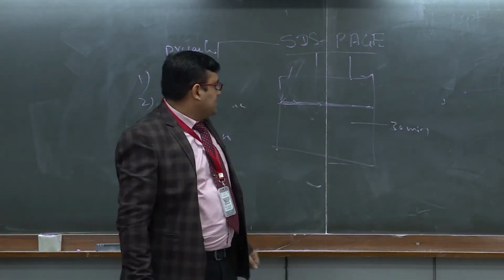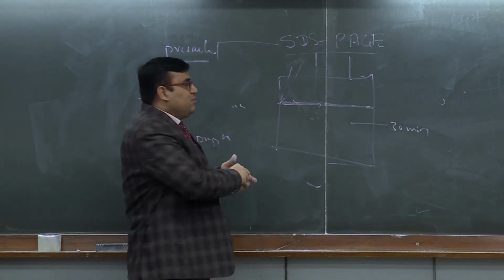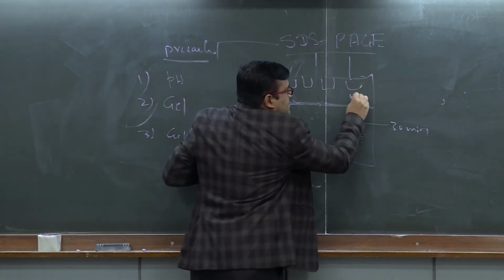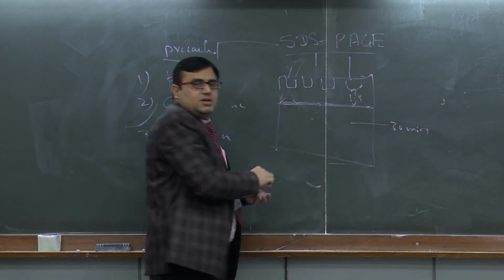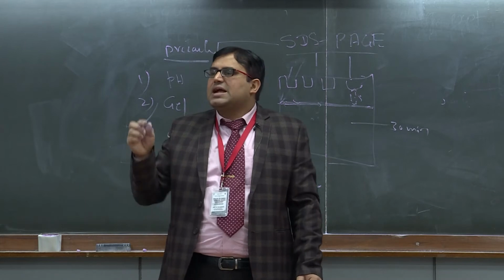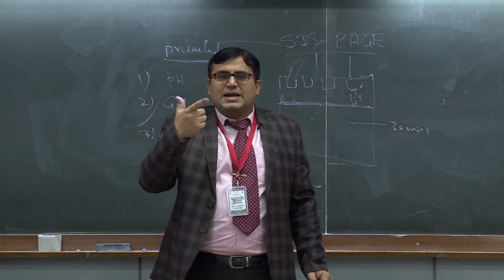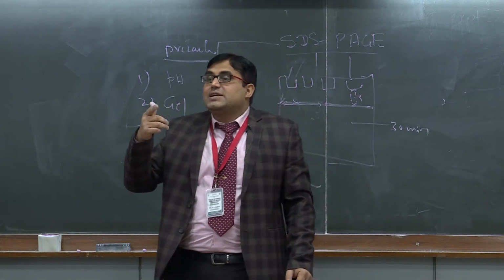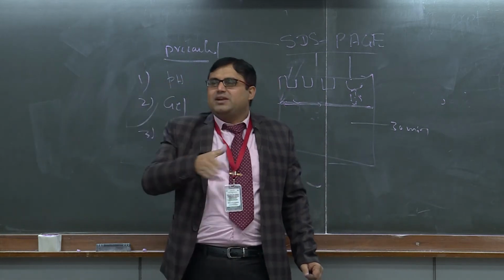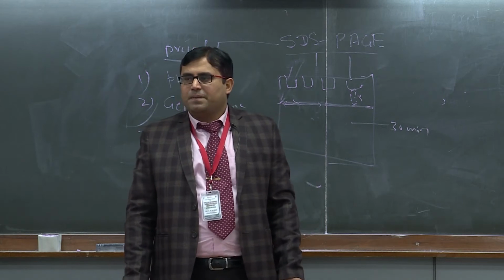And the last point is, once this is polymerized, when you load this stacking, this is our comb. This distance you have to maintain. If the distance is not maintained, minimum 1.5 centimeters, then the travel area will be less, so your protein will not be stacked. If it is not stacked, you will get smearing. Many times if you recall your result, you have got smearing in the lane. This is because of manipulation in this particular area, right?